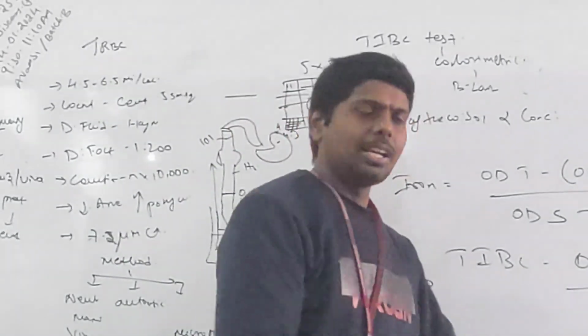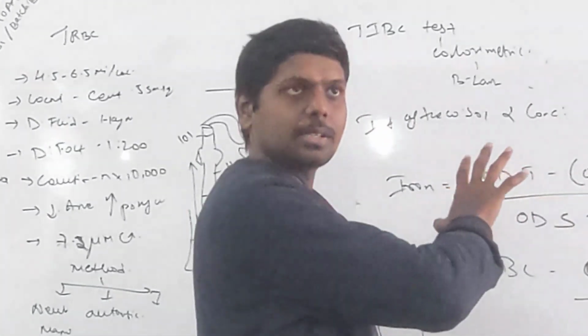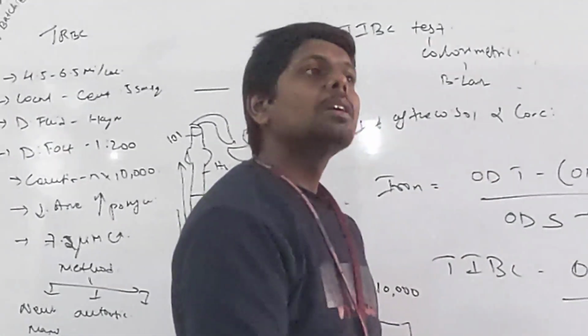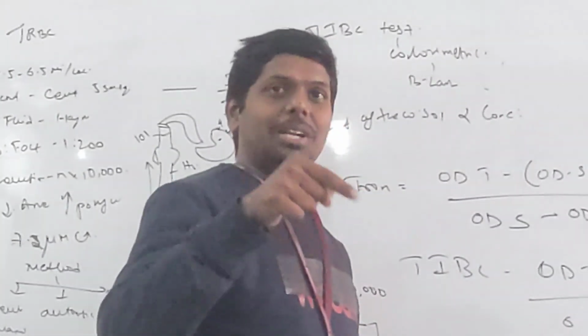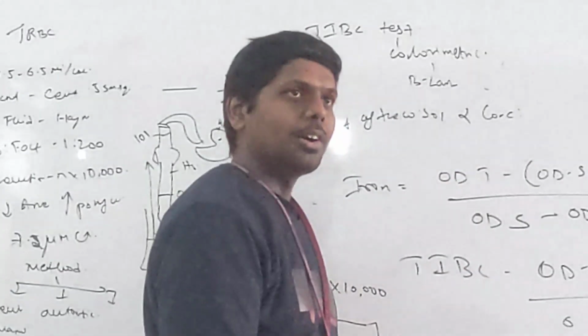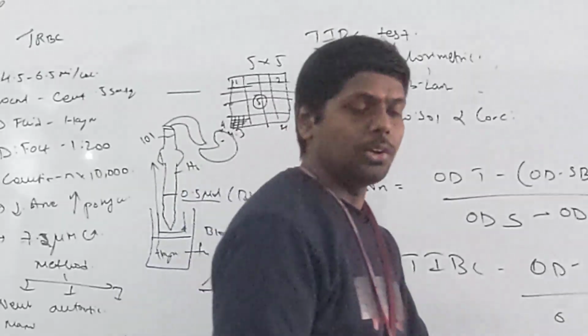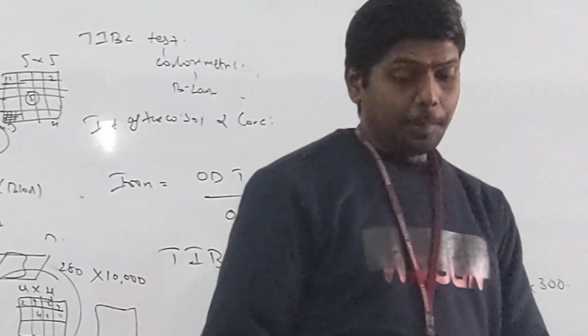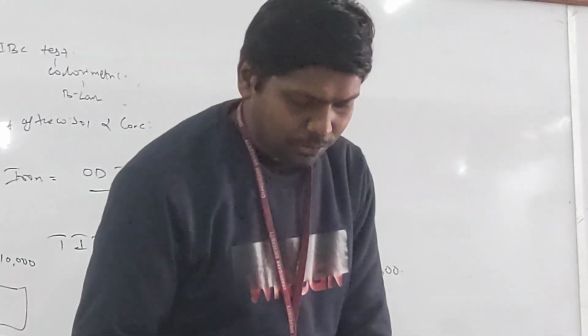First keep the filter, then go for measuring. There will be approximate ranges of filters, so you can keep a similar range, like 542, 590 or 600. That depends on the kit actually. It varies from kit to kit.